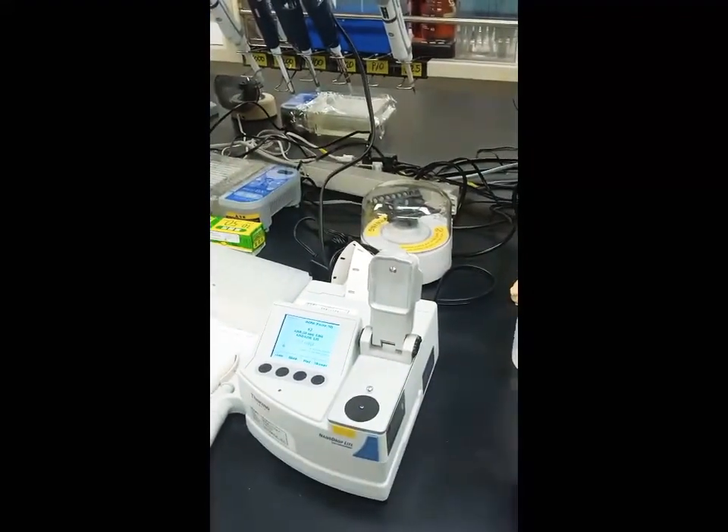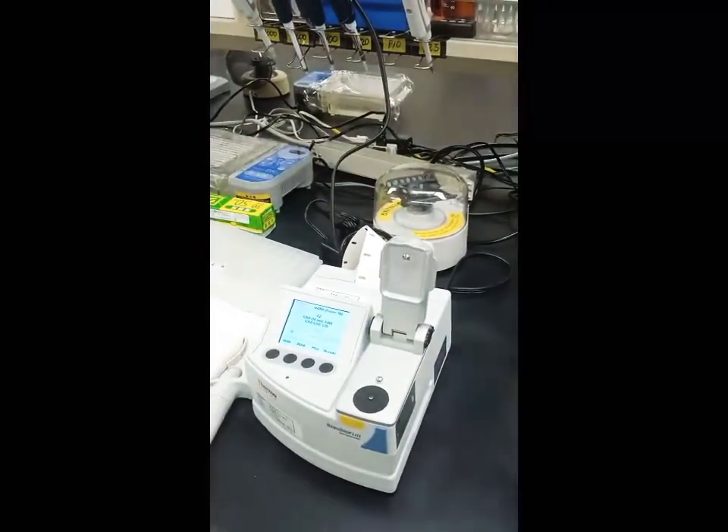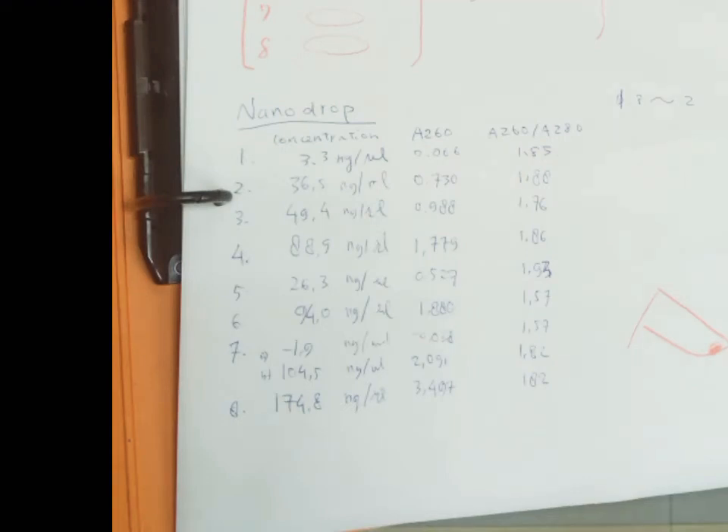For the next sample, clean the sensor again and then put your sample there. This is the result of today's exercise: out of 8 samples, almost all of them have a ratio value between 1.5 to 2, so all samples are good to go for the PCR test.